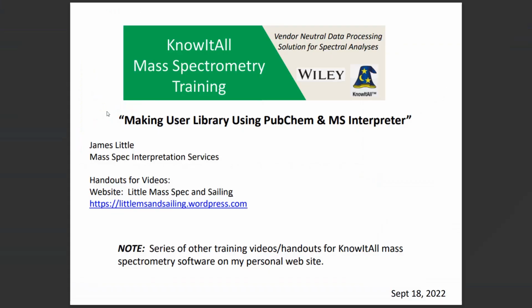So in conclusion, I hope this video will be useful to you in making user libraries for yourself using these handy tools, PubChem and NIST MS Interpreter. Note, there's a series of other training videos and handouts for KnowItAll mass spectrometry software on my personal website.